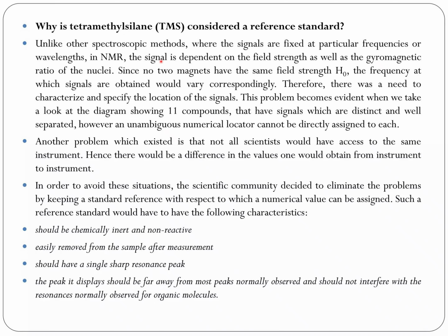So why is TMS the reference standard? It has some characteristics which make it very suitable as a reference standard in NMR. For example, an ideal reference standard should be chemically inert and non-reactive, easily removed from the sample after measurement, and should have a single sharp resonance peak. The peak should be far away from most peaks normally observed, and should not interfere with the resonance normally observed for organic molecules. All of these properties can be found in TMS.